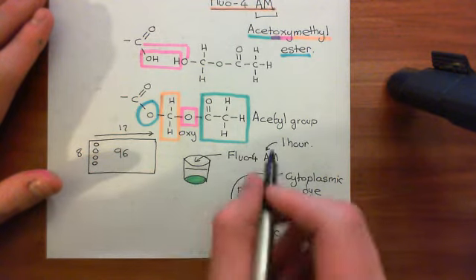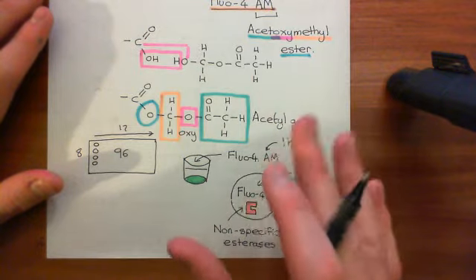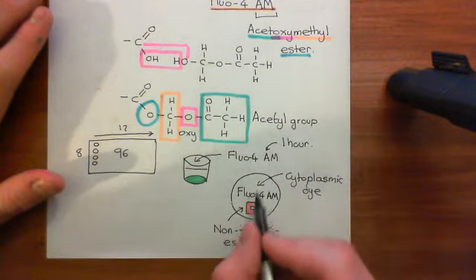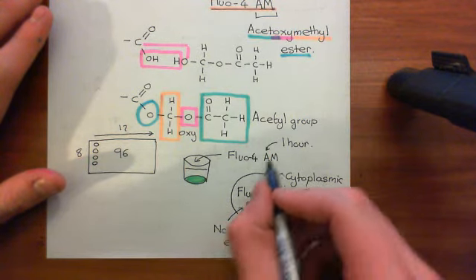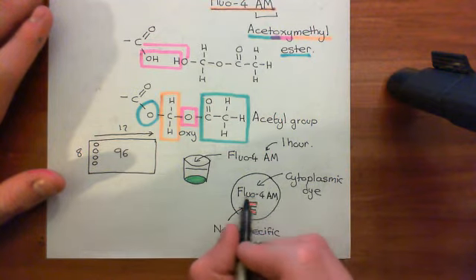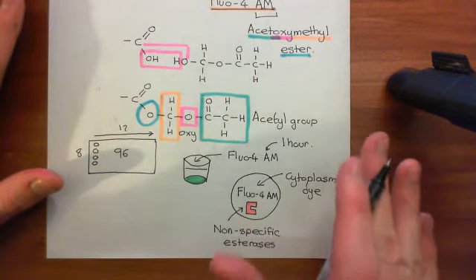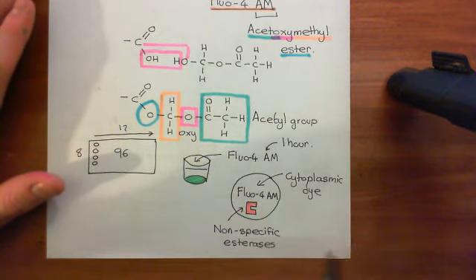containing solution. You put it back in another solution. You generally leave it half an hour just to allow everything to normalize, to allow Fluo-4 AM molecules that have not been deesterified to leave the cells and go back into this solution out here, and allow all the other Fluo-4 AM molecules that are going to be deesterified to be deesterified. So you allow everything to be deesterified or end up back in this solution, basically.